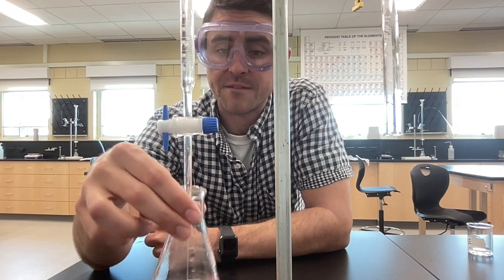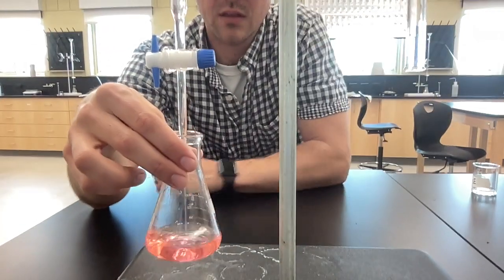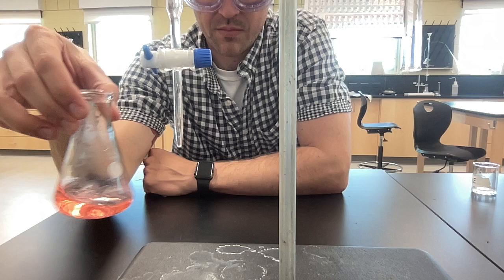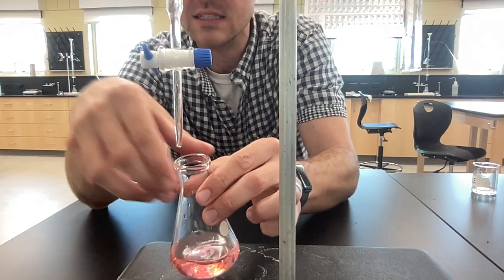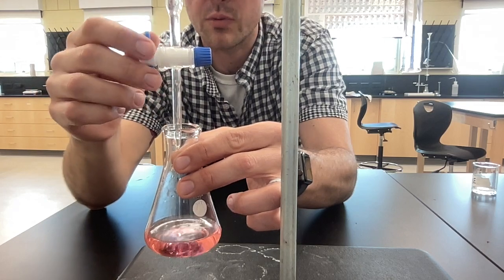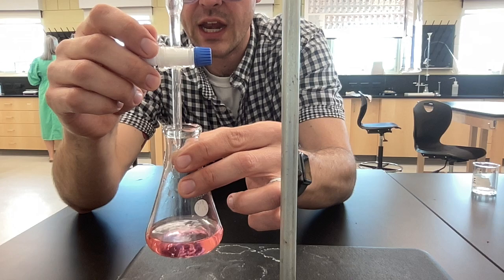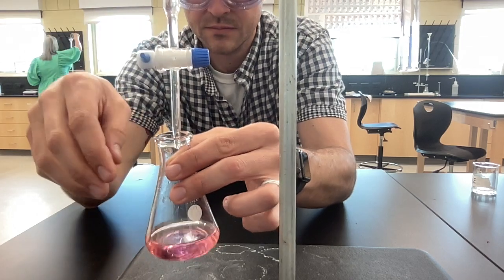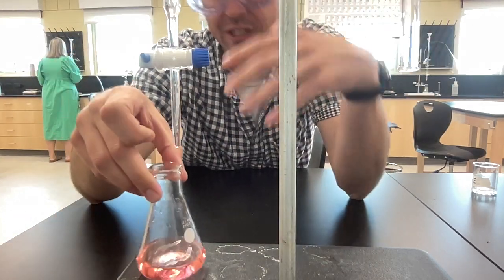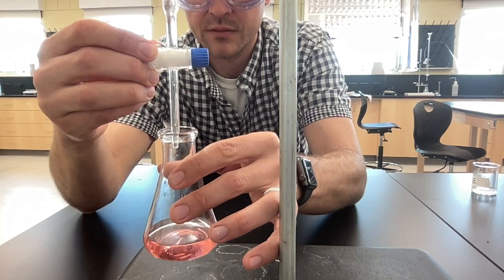Let's see, I'm down at 15 now and I'm still in acidic conditions. You can see it's still red. It's starting to turn purple, but that purple goes away and I'm at 16 milliliters. Let's see if we can get to 20 and see if it's what we predicted. Now we're at 18, now we're at 19. It was purple for a second till I swirled it and mixed it up, and now it goes away. Let's go right down to 20.